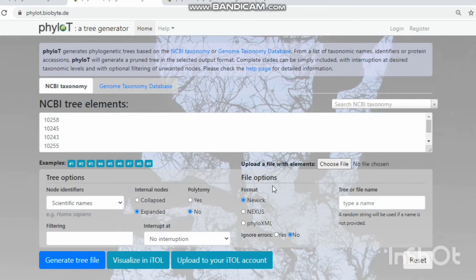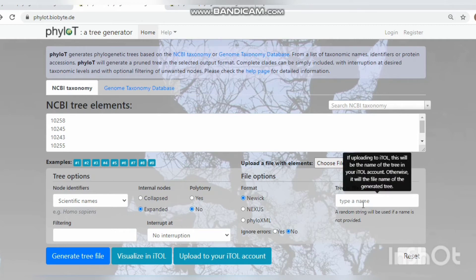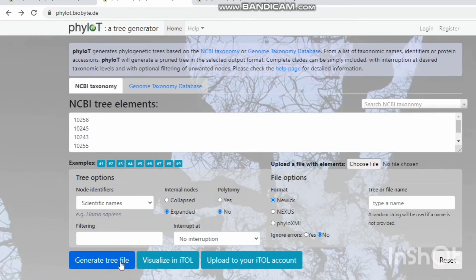PILOT provides three types of file formats. The tree name option is used to specify the tree name. The generated tree file option is used to download the binary or phylogenetic tree. Click 'Visualize' to generate the phylogenetic tree. The upload option is used to add your tree to your account. Only 8 species can be used to create a phylogenetic tree freely; if you want to add more species, you need to create an iTOL account.